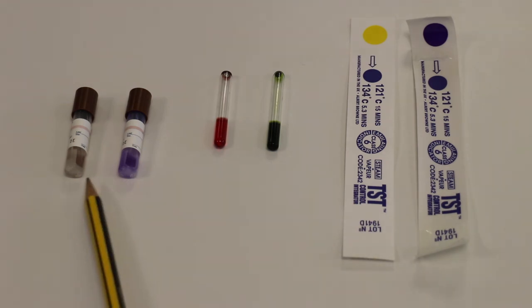For the biological indicator, we've got some spores which were impregnated onto the filter paper.